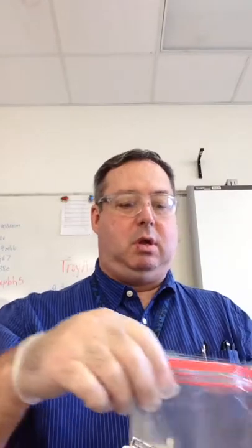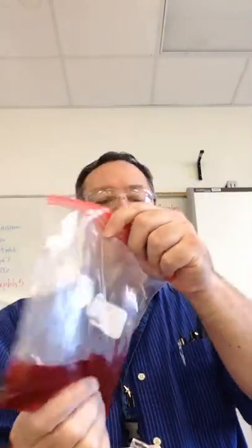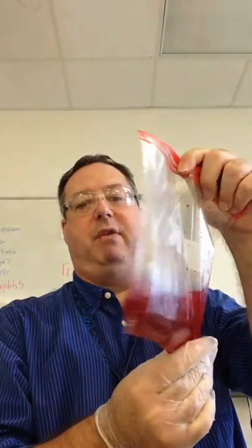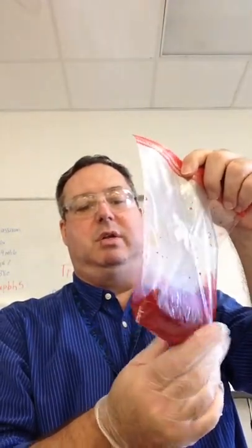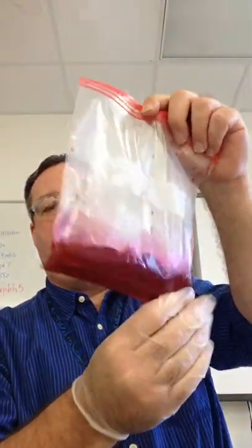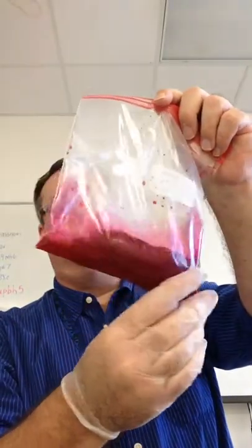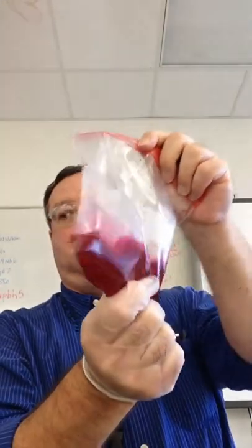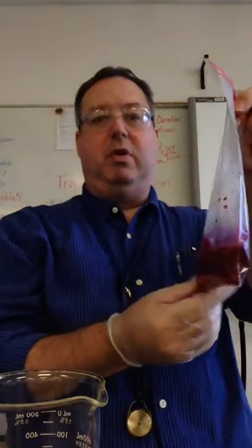One, two — okay, close the bag and slosh gently. I am already feeling a little bit of warmth in that liquid. Feel a little warmth in the liquid. Make sure you know whether that's endothermic or exothermic. Observe the contents of the bag. I'm sloshing it, trying to get all the solids dissolved. I can tell you that's warmer than what it started out as.